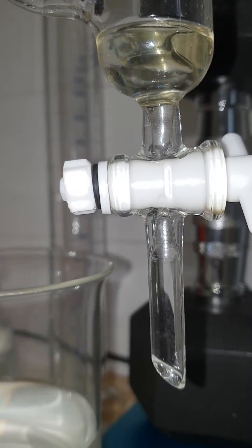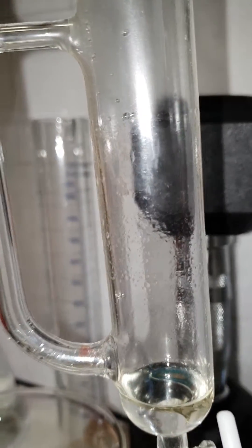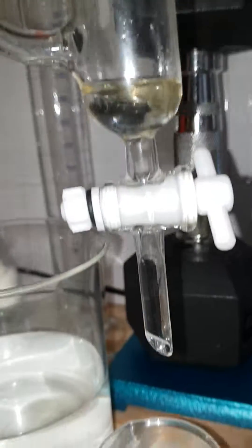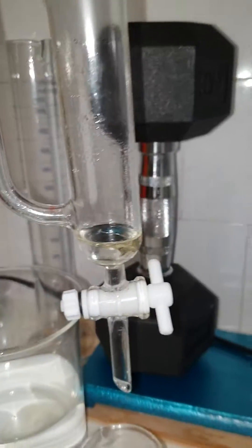We'll wait a few minutes to let all the oil on top drip down, and we'll find the right solution for it. Anyway, this is it for now.